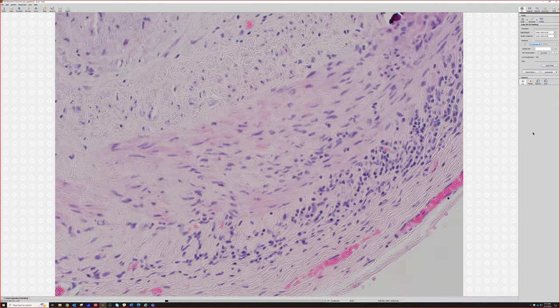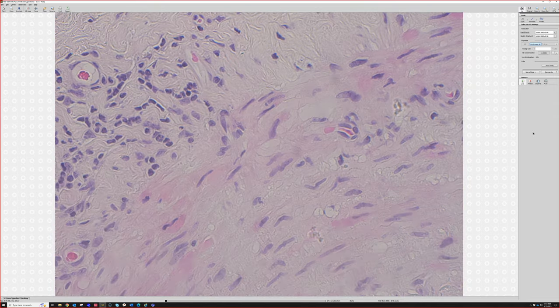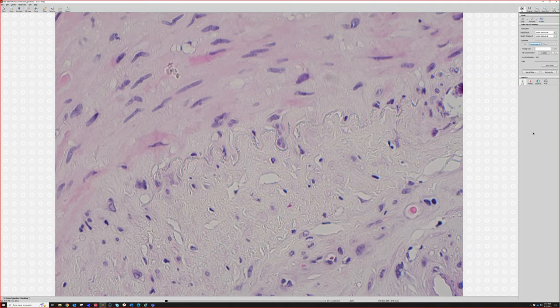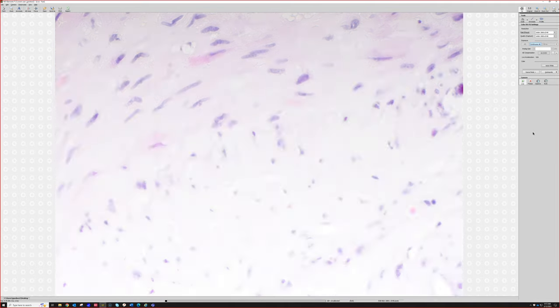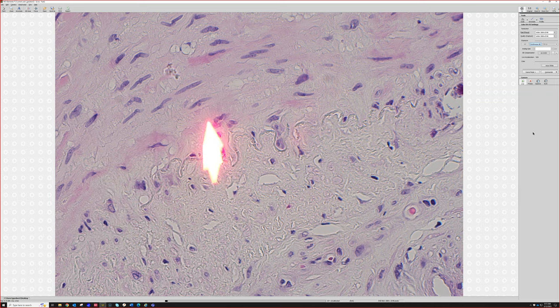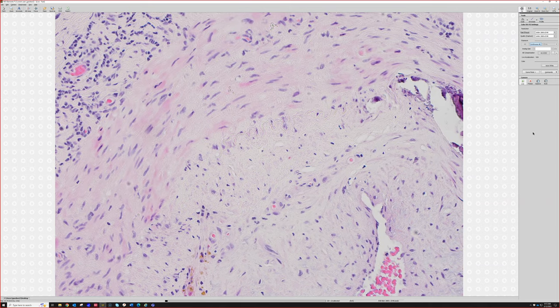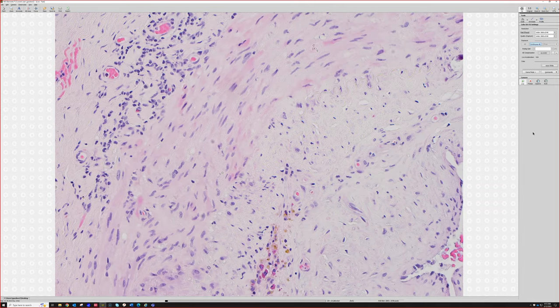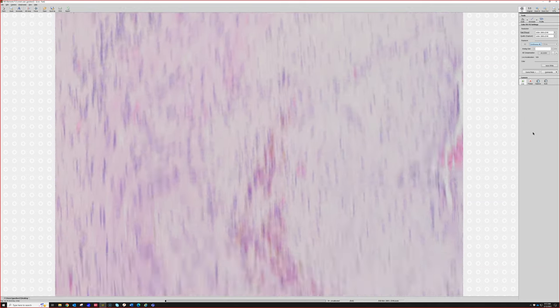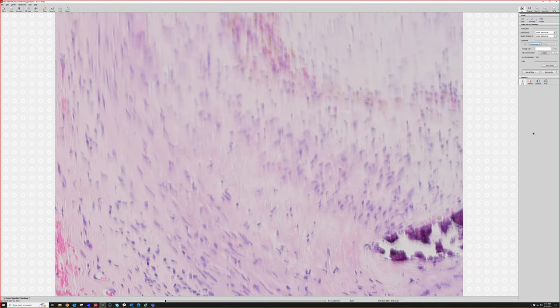So let me see if I can find some intact elastic lamina to show you. I don't know if there's any left here. Ah, there. So the elastic lamina, you can do a Verhoeff-van Gieson elastic stain to highlight it, or if you have a light microscope, you can flip your condenser, and that little squiggly line right there, see how it stands out? And you can see it go up and down. That's the elastic lamina. And so for some reason in giant cell arteritis, the giant cells and histiocytes and inflammation are attacking right around that layer, and that layer gets destroyed. See how it goes along here, and then it disappears. It just squiggles out into nothingness and then is replaced by all that inflammation. So that's what's happening. You can see some little fragments left over down here, but it's destroying the elastic lamina.